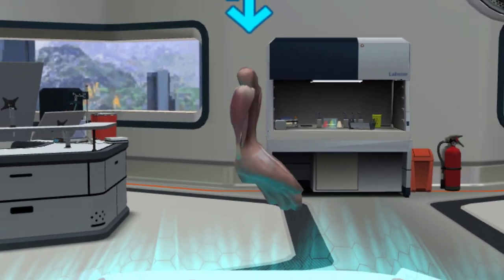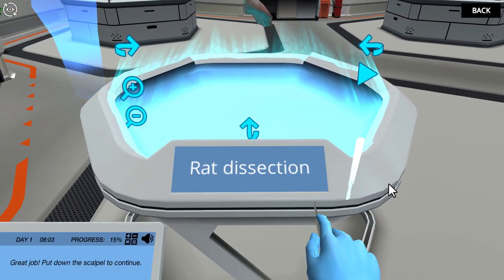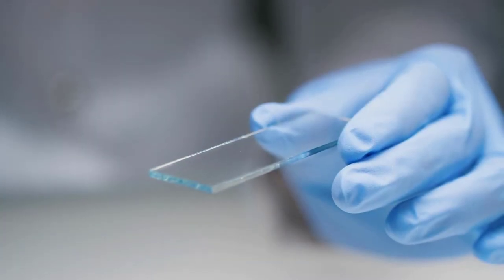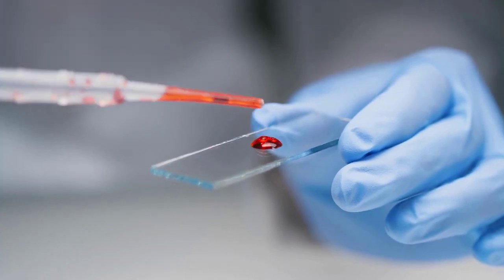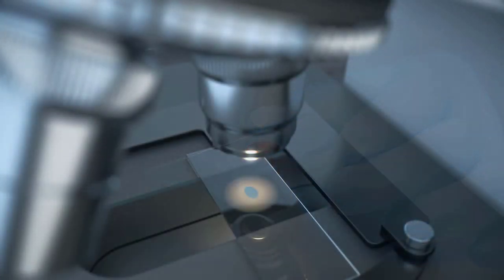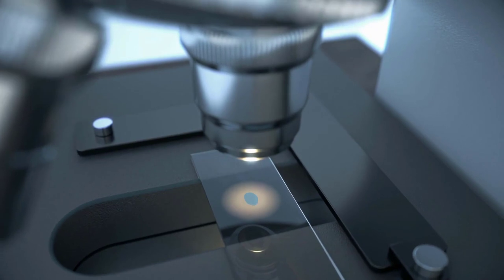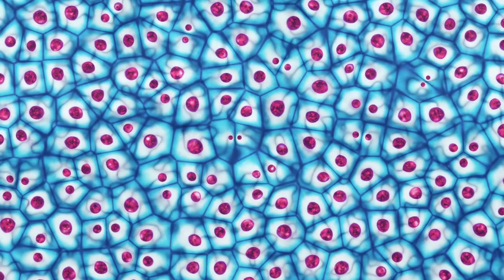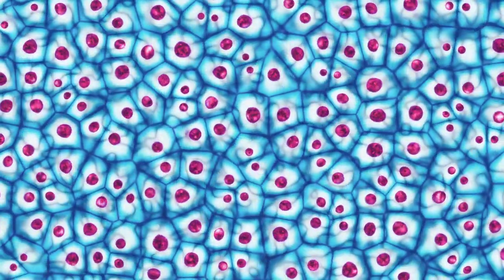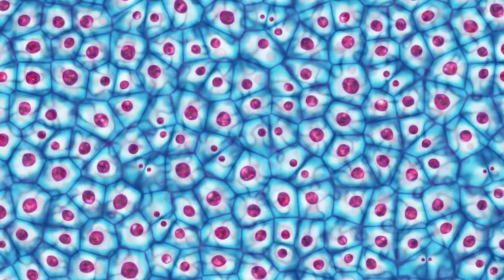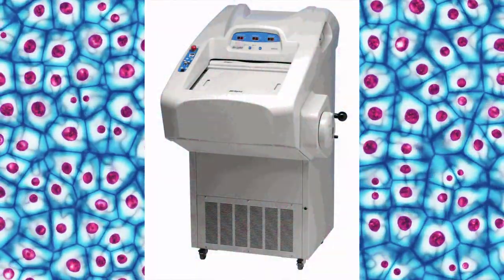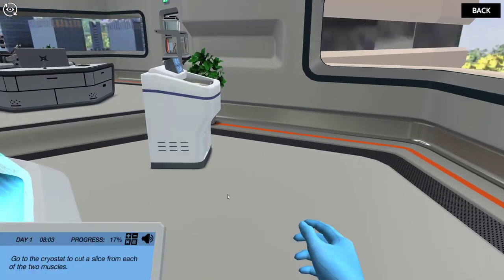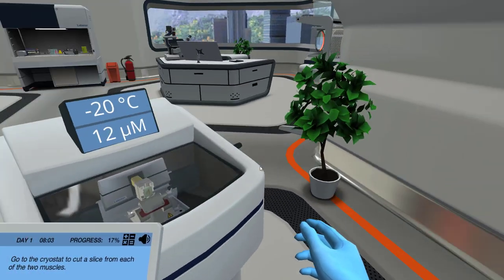Great job! Put down the scalpel to continue. To determine the fiber composition of each muscle, you can dye muscle components and organelles using chemicals. This is called histochemistry. Afterwards, you can distinguish the different types of muscles under a microscope. This only works with very thin slices of muscle tissue, about 12 micrometers thick. You'll need a cryostat to cut a muscle slice this thin. Luckily, we have one in the lab. Go to the cryostat to cut a slice from each of the two muscles.